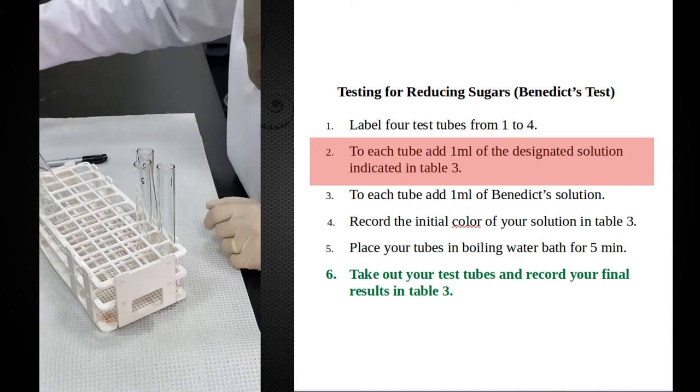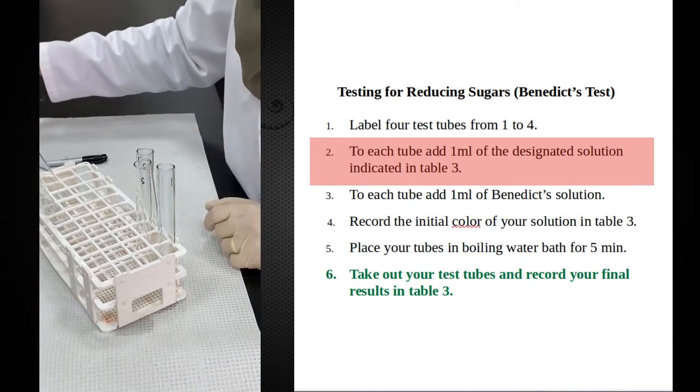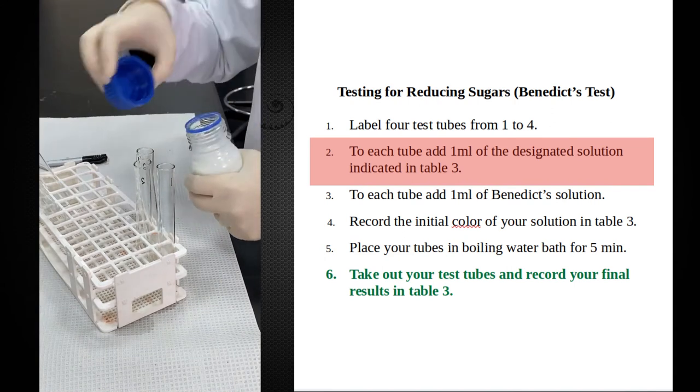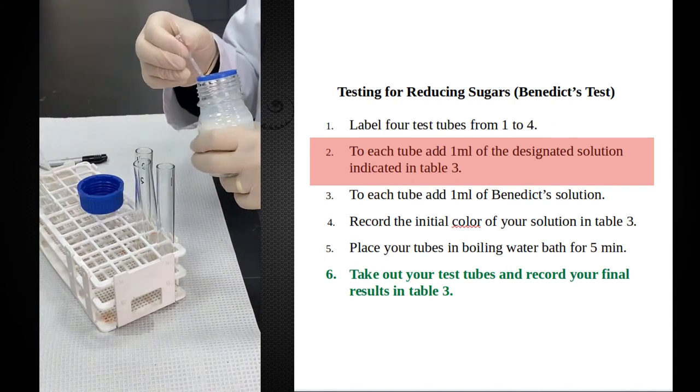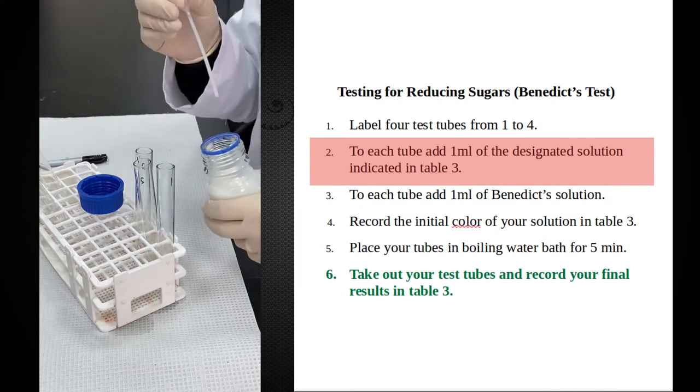And then I will test the milk to see if the milk contains reducing sugar or not. If you need to test more test tubes, you just label more test tubes and you do the same procedure to each of those test tubes.